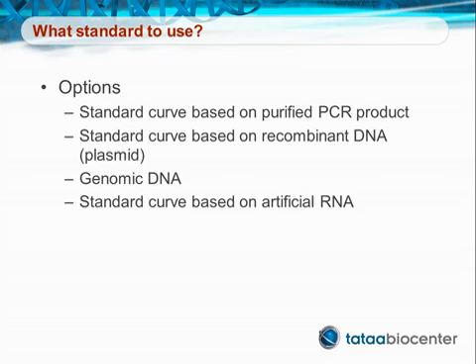No matter which option is used, the standard you have produced needs to be thoroughly purified, quantified and diluted to cover the range of your unknown samples.